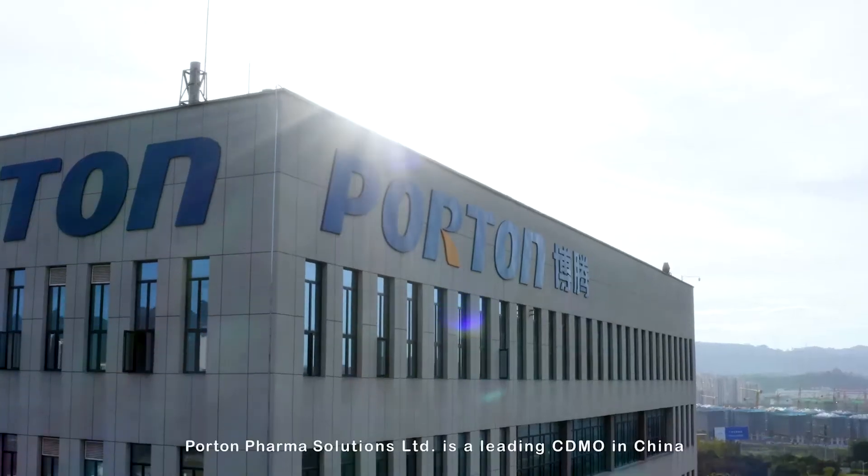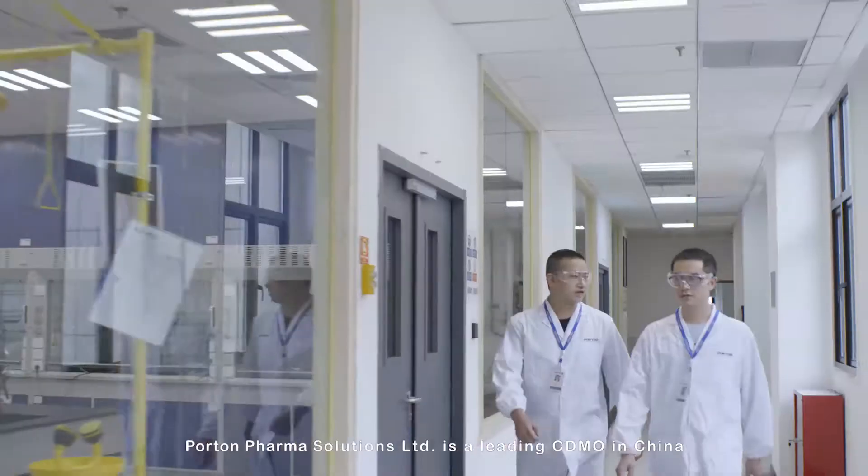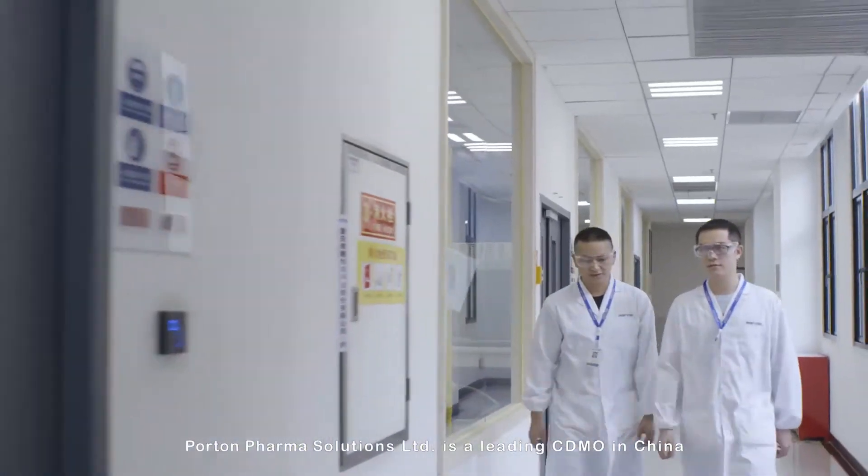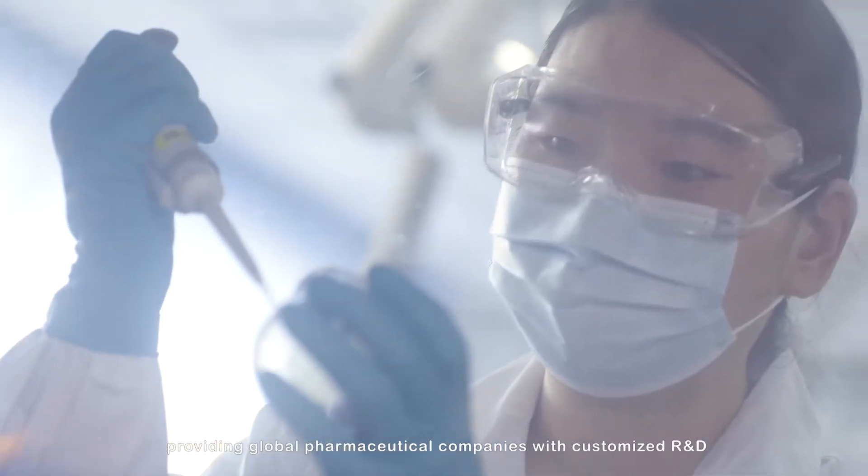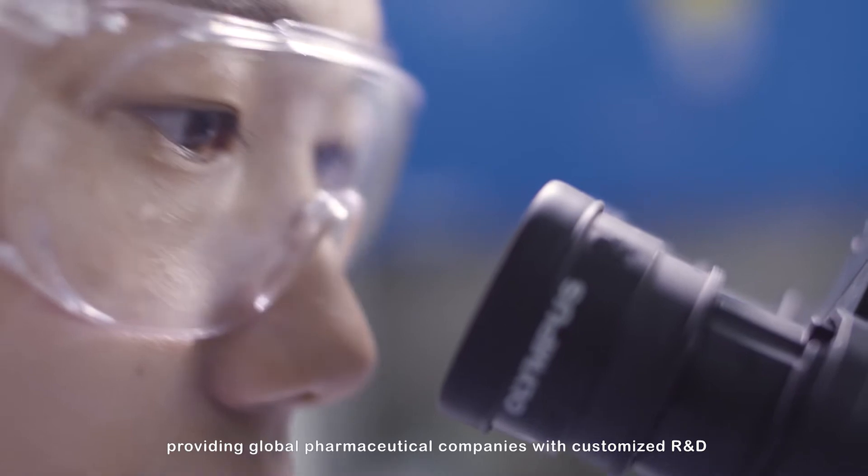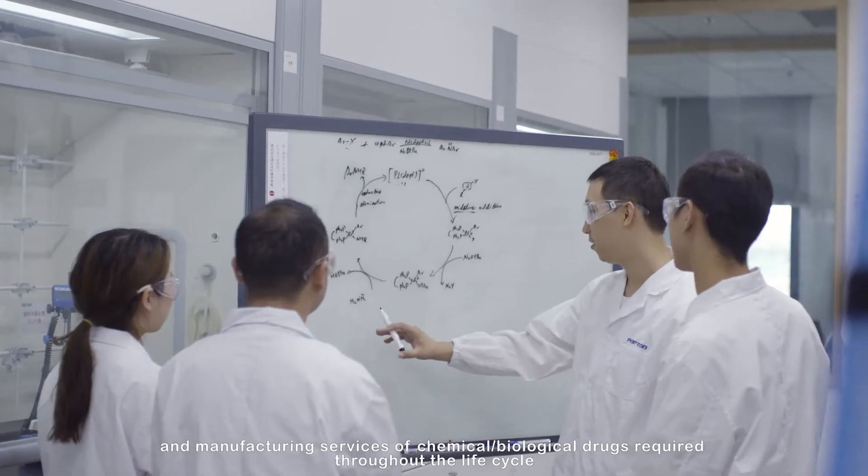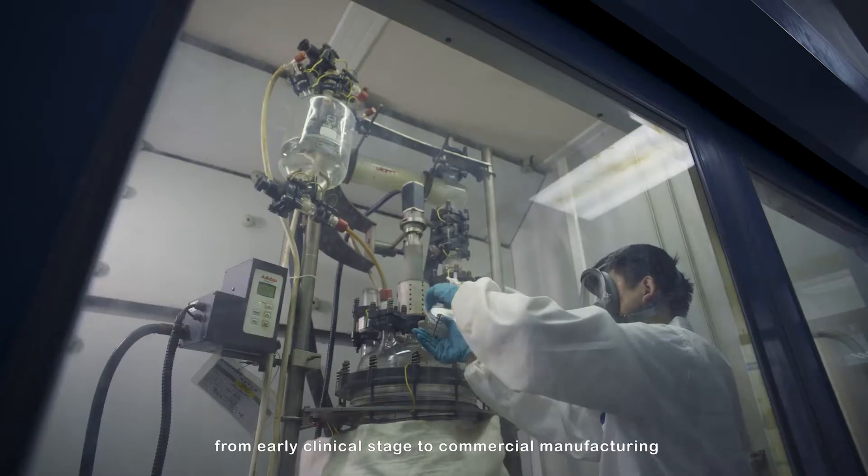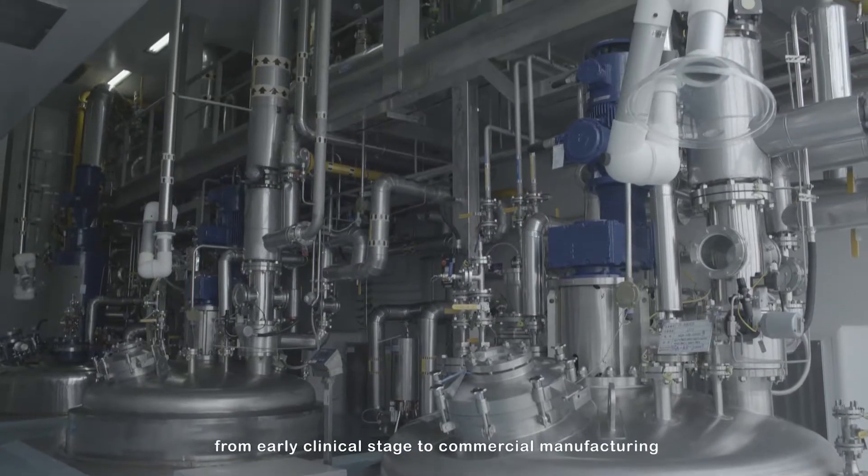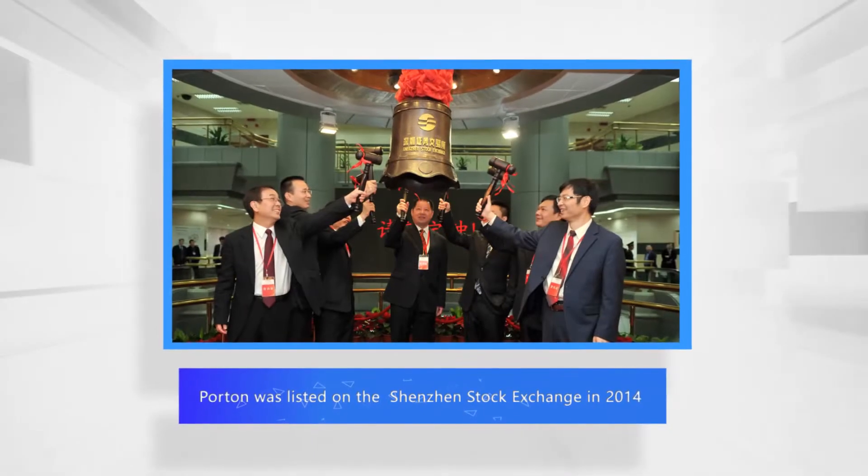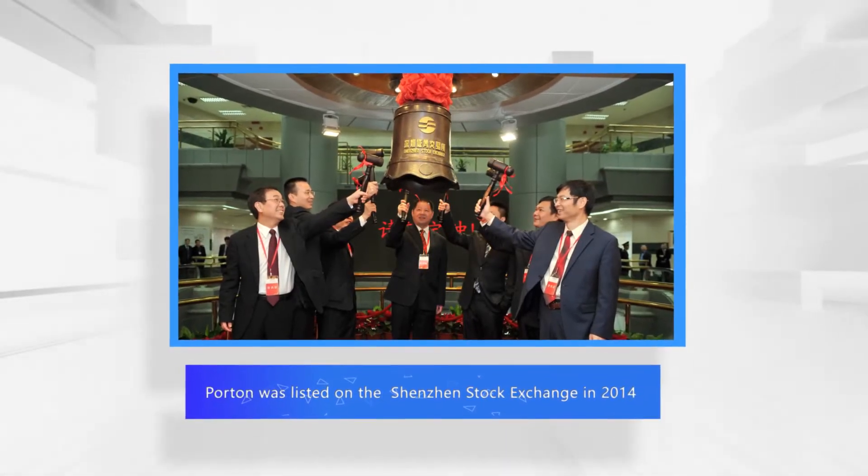Founded in 2005, Porton Pharma Solutions Limited is a leading CDMO in China, providing global pharmaceutical companies with customized R&D and manufacturing services of chemical and biological drugs required throughout the life cycle from early clinical stage to commercial manufacturing. Porton was listed on the Shenzhen Stock Exchange in 2014.